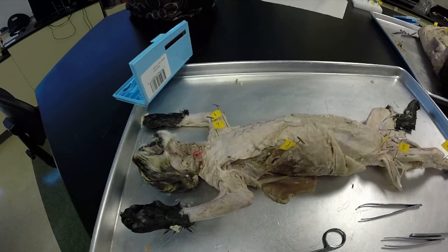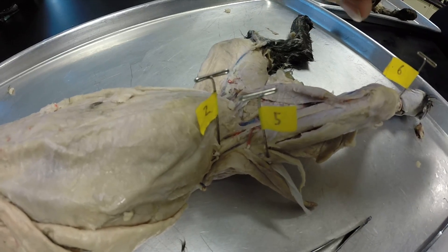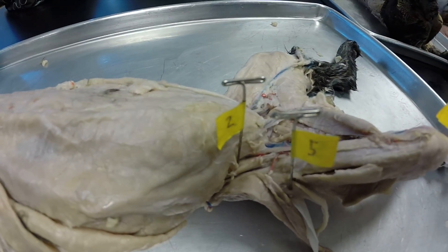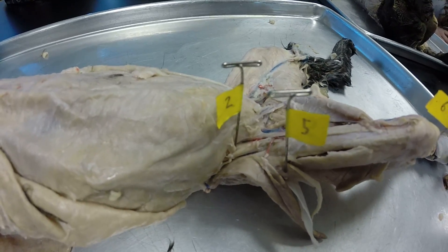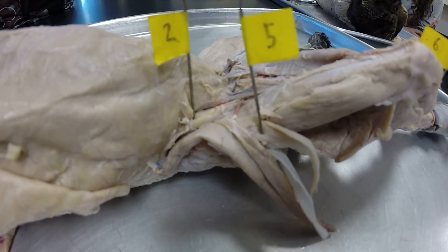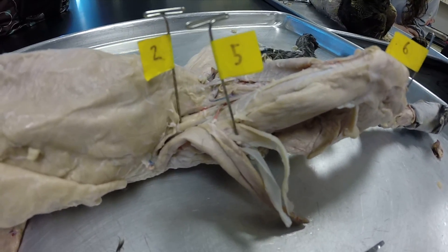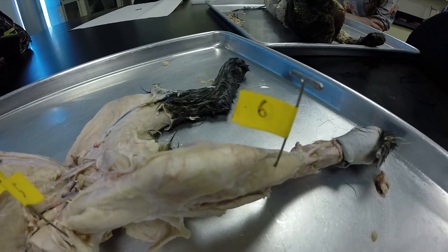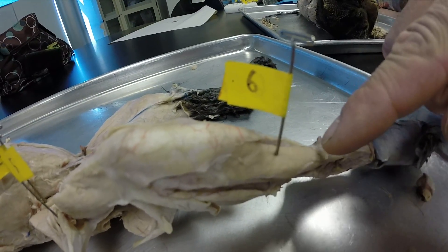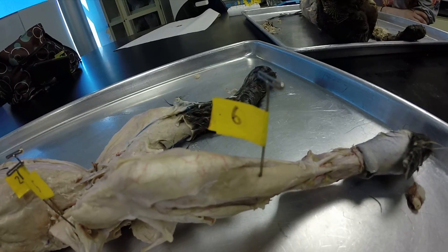We've come to a new station and we've got a bunch of muscles down in here. Number two is a muscle that's running with the axis of the body right there at the leg — that's our iliopsoas. Number five: the directions say name this muscle, and you can see the connective tissue on it — that is our tensor fascia lata muscle. Number six: when it comes to the lower legs, follow these muscles down to the foot. This one is going straight down on the front of the foot — that is the anterior tibialis.